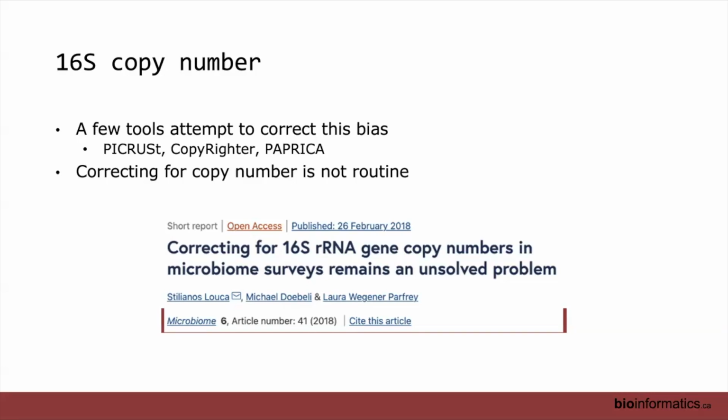They showed that it worked in stool samples, which have very high bacterial biomass. They said that the amount of DNA in their samples originally was highly correlated with the actual counts of bacteria within those samples. In my opinion, they only showed that within those stool samples.